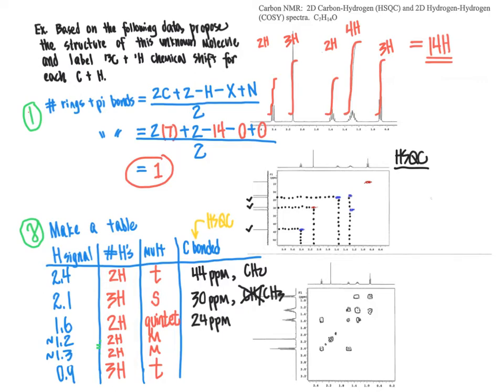And so filling that in, the 1.3 ppm signal goes with a carbon chemical shift at 23 ppm. And then at 32 ppm, we saw the 1.2 ppm signal. So we had this 1.2 ppm signal showing up at about 32, and the 1.3 ppm signal we said showed up at 23. And that would account for two of the signals in the carbon spectrum here and here. And then we have one signal left that we see showing up here in our carbon spectrum that we haven't accounted for yet. That is the signal right here.